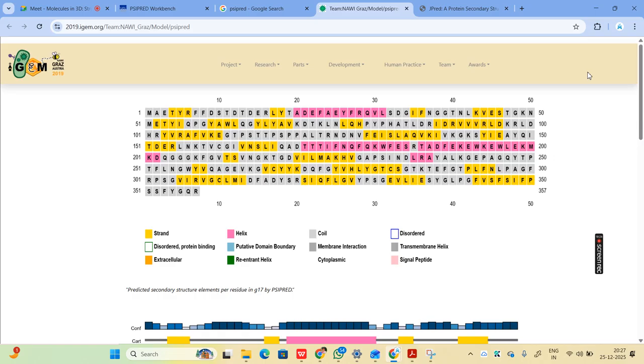Okay, you people are right, because if a signal peptide is present in the starting region, as we discussed, it should have a lot of leucines. Here it does not have leucine, and we are doing secondary structure analysis. What I told in today's session also, the signal peptide will always be a helix, and in this starting region we don't have any helix, only a small region has a helix, and we don't have any leucine residues either.